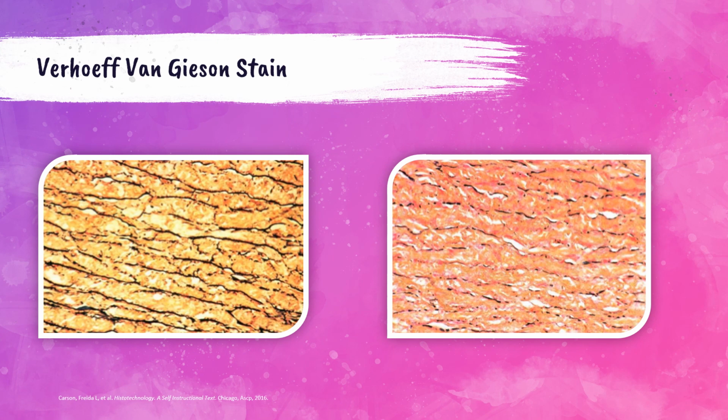The photo on the left-hand side of the slide here shows a Verhoeff Van Gieson stained aortic wall, which is an elastic artery. The black lines on this section are the perforated laminae of elastic tissue. The yellow in this photo is the smooth muscle, so the smooth muscle cells, and the red color are the collagen fibers. The photo on the right-hand side of the slide is the same tissue, but just has been over-differentiated. So see how there is less black on the photo on the right-hand side? So that black are the elastic tissues. So the lack of the slightly grayed background and bright yellow muscle fiber staining is indicative of over-differentiation.